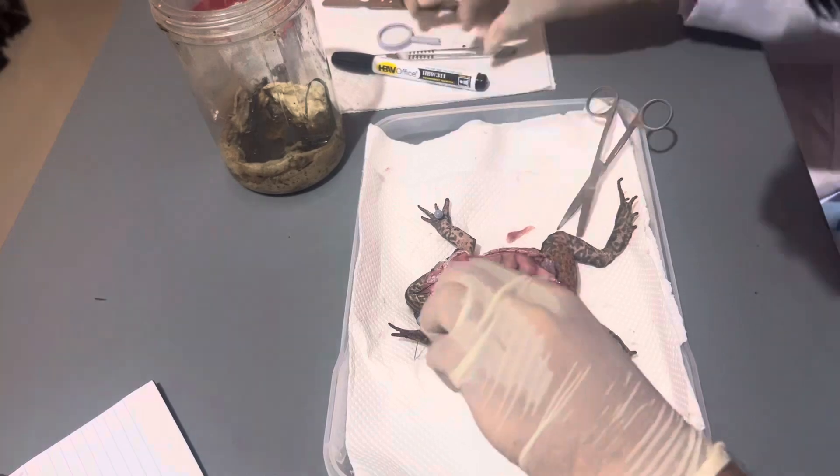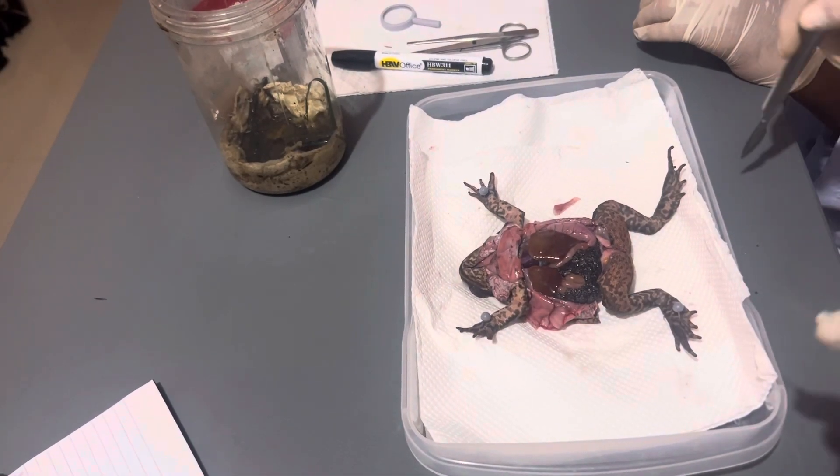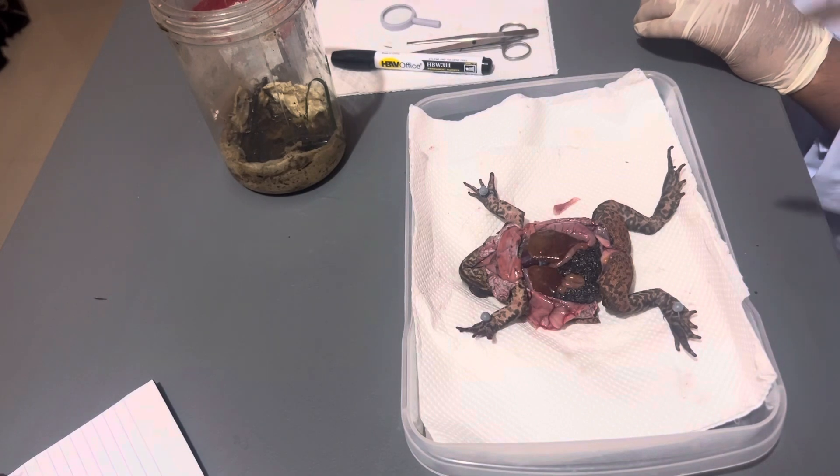Then I am continuing to cut the muscles. And finally, the toad's internal organs are exposed and ready to be examined.